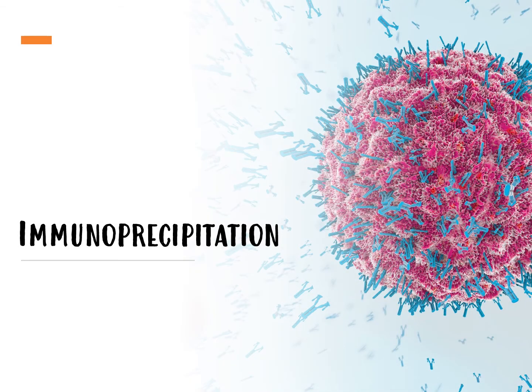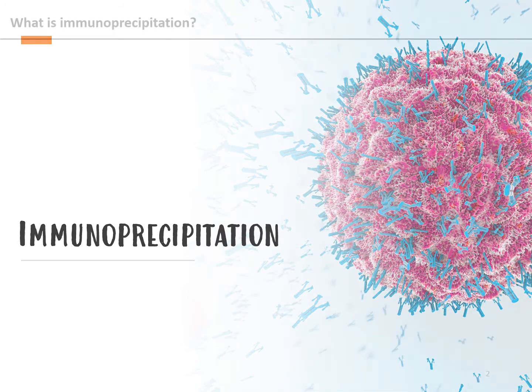Today we are going to be discussing immunoprecipitation. This is going to be a brief discussion and it is one of the applications of Western blotting and SDS-PAGE, some of the things that we have learned so far. So delving right into it without wasting much time, immunoprecipitation. So what is immunoprecipitation?